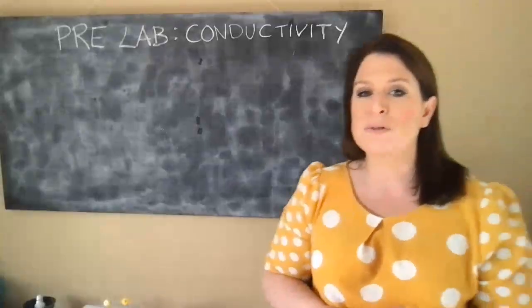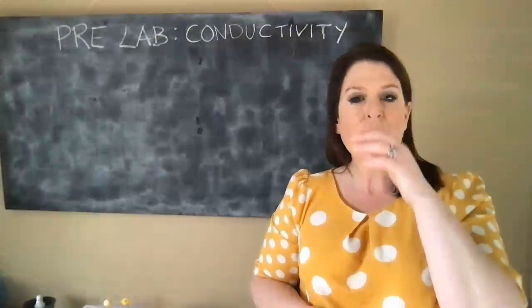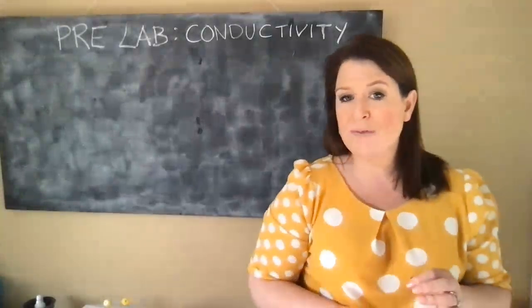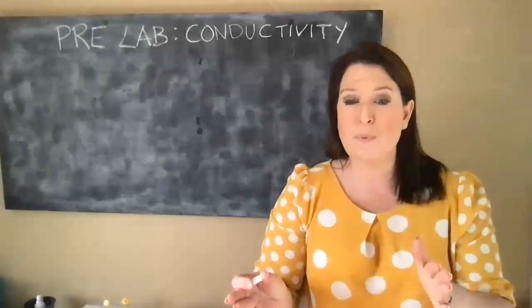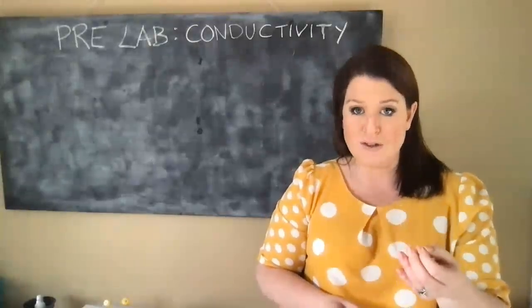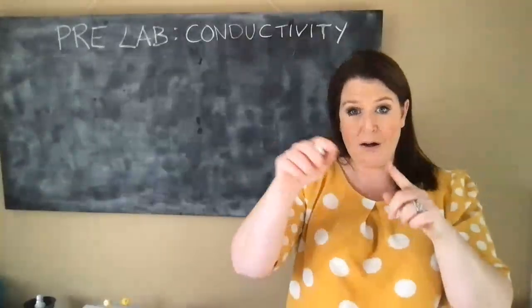So you're going to work with a solution of HCl and CH3CO2H. You're going to take 50 mL of that solution, and the technique is going to be very similar to a titration you will have done last year, where you monitored to find the equivalence point. Instead of using an indicator, you monitored the progression of the titration using a pH meter. So you had a beaker rather than a conical flask.